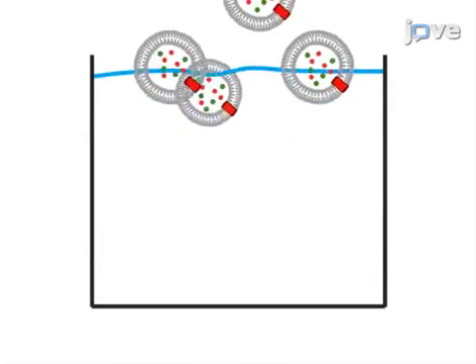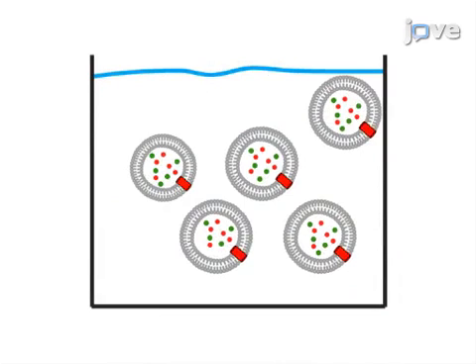After removing the external chloride ions so that there is an outwardly directed ionic gradient, the liposomes are added to the recording chamber where the chloride concentration is monitored using a chloride-sensitive electrode.